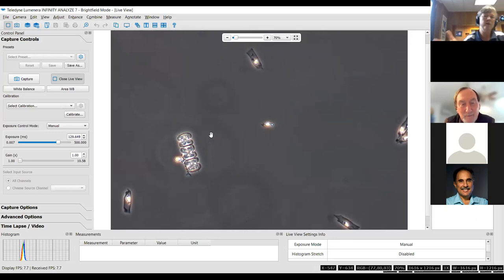So the one thing you notice is that, as we're looking at these slides, Ken sees certain things, I see certain things, and Andy sees certain things. And so it's not a bad thing to talk to friends, to phone a friend, and to have different people. You might key in on one feature, and somebody else who's a little more familiar with the group or just happened to see it recently might see something else. So even we on occasion will go back and forth.